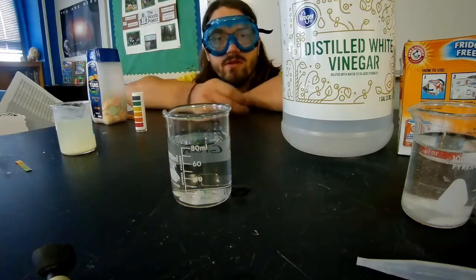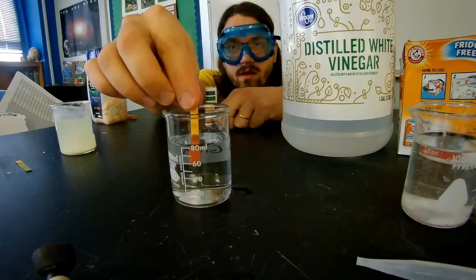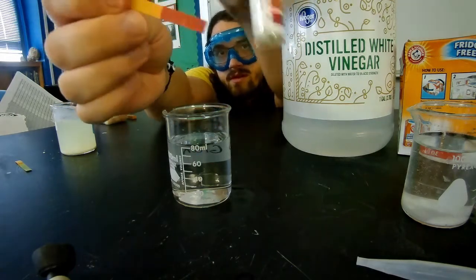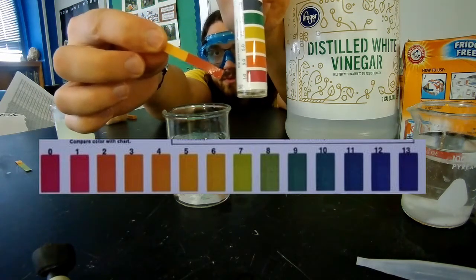All right, let's move on to our next chemical. This is vinegar. Let's see what we get with vinegar. Well, that's a pretty clear color change there this time. And what do you think for the pH of vinegar? And is it an acid or a base?